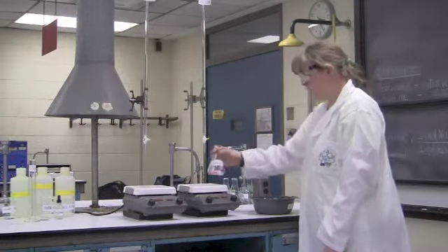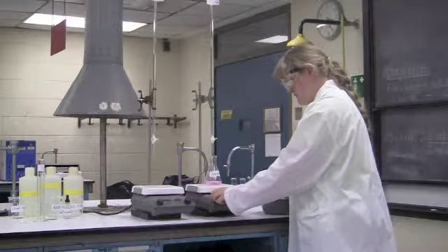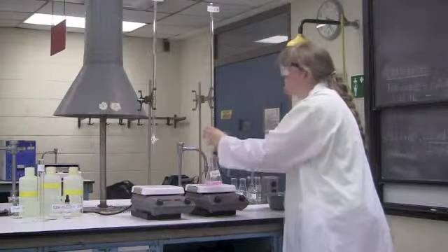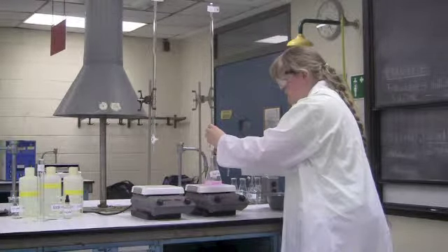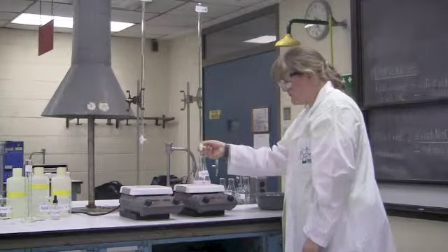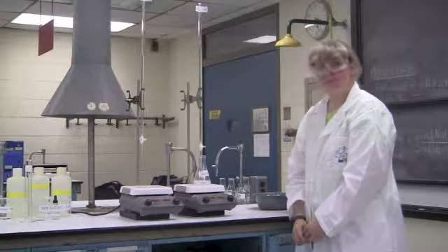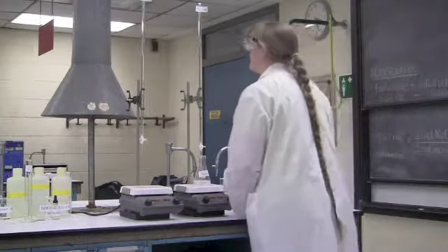We're going to remove the analyte from the ice bath, and we're going to titrate the analyte with the HCl, 0.1 molar. She will now add 0.1 molar HCl until the solution turns from a light pink to a cloudy white. The solution has now changed to a cloudy white, and the initial volume of the reading is 0.00 mLs.